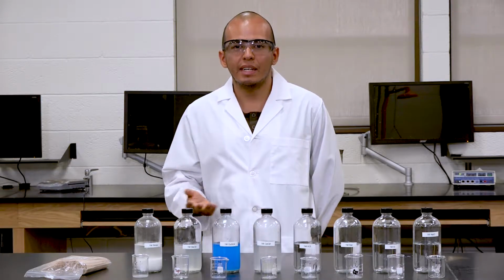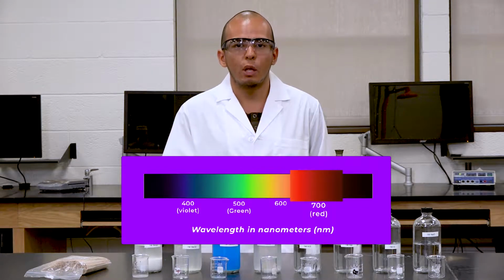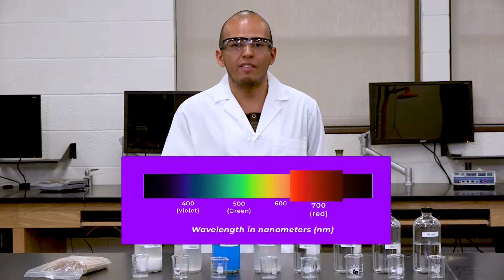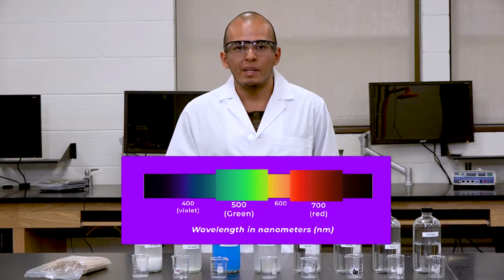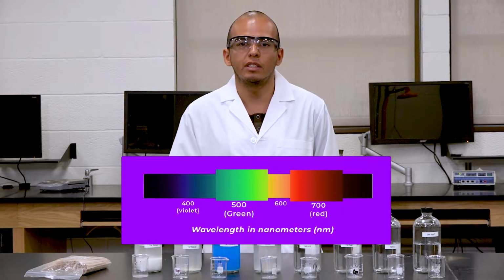light. From this light, we can actually depict if it's associated to a specific wavelength. This wavelength can actually depict what kind of color that atom emits. For example, if the atom or the substance emits a red color, it corresponds to a wavelength of about 700 nanometers. However, if it emits a green color, then it is approximately 510 nanometers. So by this mechanism of exciting the electron from a lower energy level to a higher energy level and the relaxation back to its original shell, we can see this emission through a photon, a light.